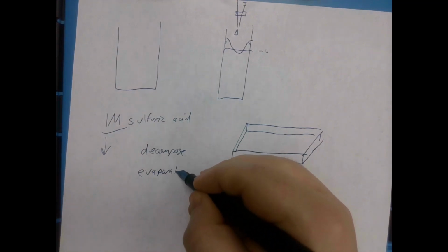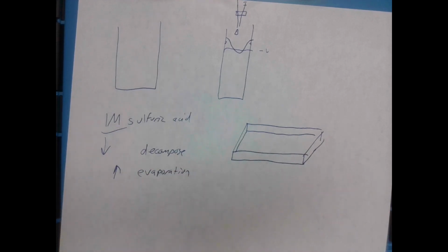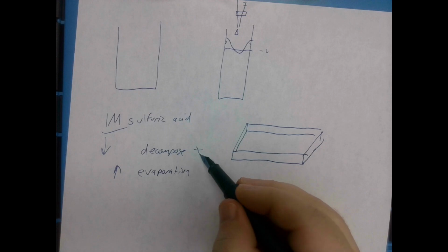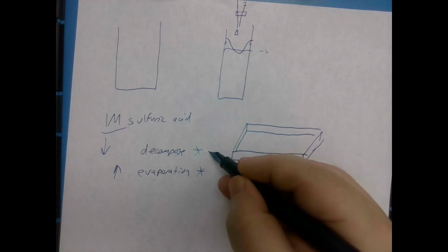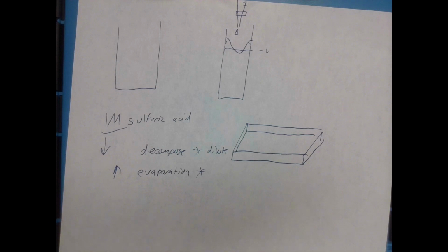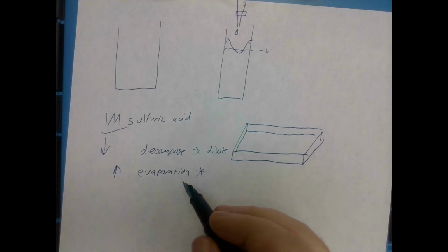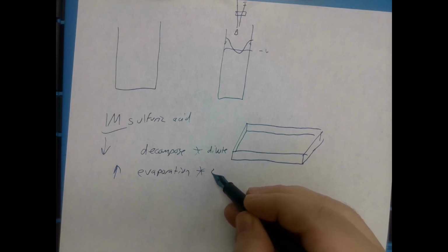What does that do to concentration? Concentration can significantly increase. So you have two things that can happen. Your concentration could become very dilute, and you do your experiment and you say, oh, my sulfuric acid is too dilute, this experiment failed. Or you can come over here and pour on one of your chemicals and then it blows up in your face, as what you thought was very dilute becomes very concentrated.